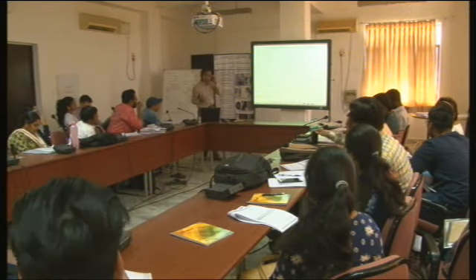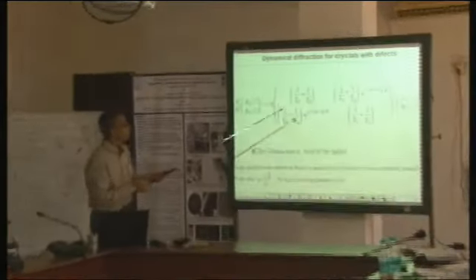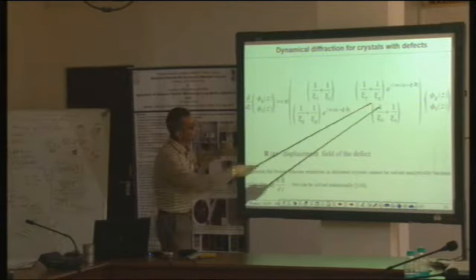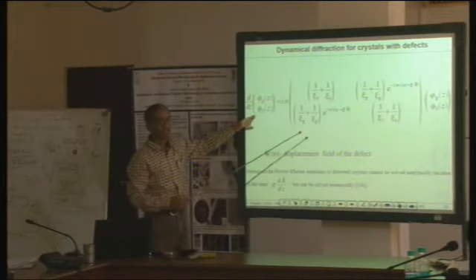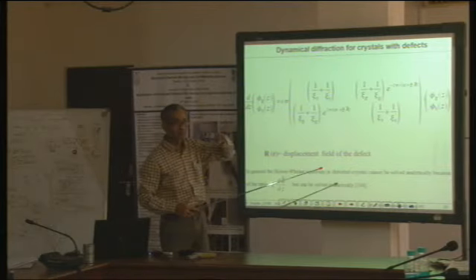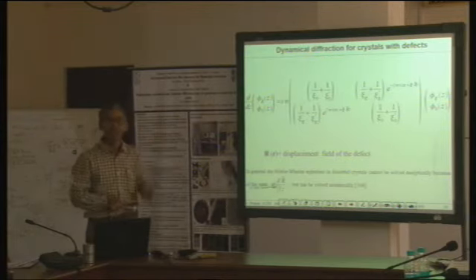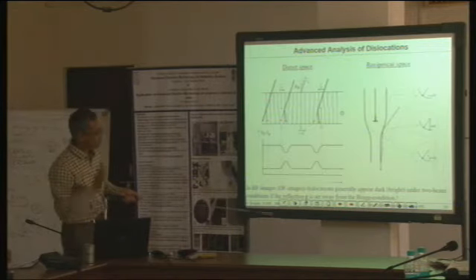Somebody was asking regarding these calculations. You see, you have to make such calculations wherein the strain field or displacement field around the defects also has to be inserted into those Howie-Whelan equations, or partial differential equations, and this can be solved analytically only in some definite number of cases. In other cases, you have to do numerical calculations and get the kinds of images that we just saw from that book. But that is okay.